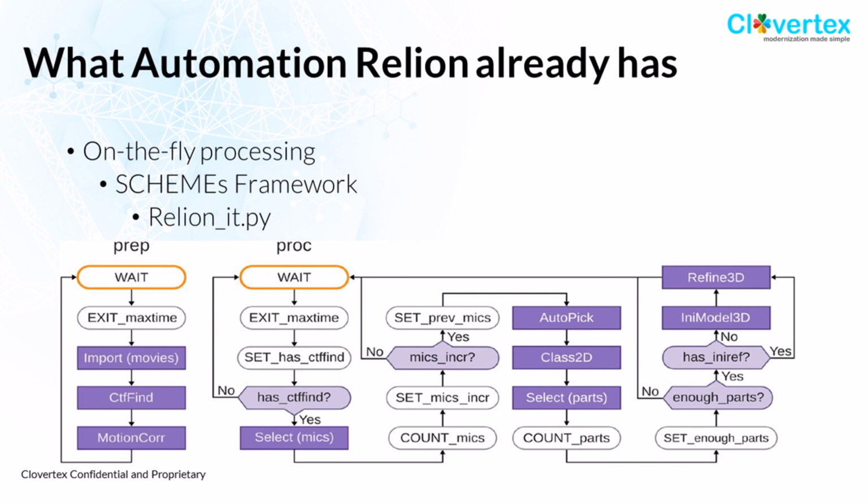So, going back to the automation. Without such an elaborate deep learning section, there is primitive and fast automation done by the Relion group. We call it on-the-fly processing, which means that while we are taking pictures one by one, we can process each movie, or micrograph movie, one by one. So the early stage of the processing can be done like this.